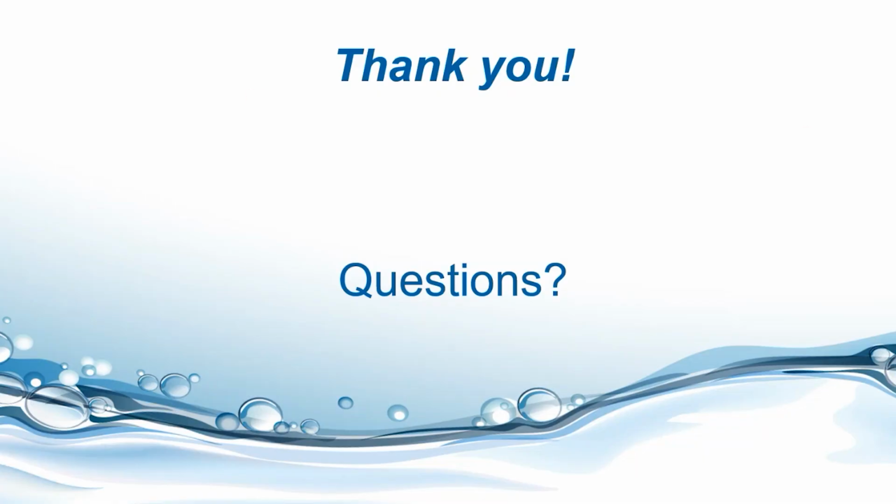All right. Next question. Thank you, Vadim. Next question is, making chlorine standards is very difficult because chlorine is so unstable. Do you have any recommendations or advice on making standards? I would say one thing I've noticed in my experience doing this, I've traveled all across Pennsylvania for PRWA running chlorine standards, and my biggest thing was the water source. Your DI water, not all DI water is created the same. So if I ever had any issues, sometimes I would notice that maybe one brand of DI water was slightly better than others. And so that's one thing you can tackle.